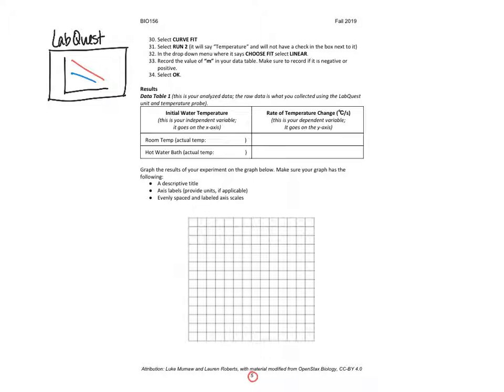From there, remember that you took the slope of the line, and the slope of the line is just how steep it is, all right? So this is the slope, and this is that M value that you got when you did the analysis steps up here and on the previous page. Those are the numbers that you should have put in to this area right here.